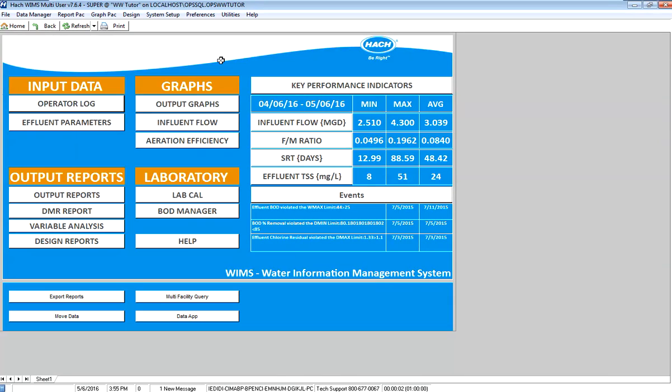In this video, I'll be covering entering data using monthly data entry forms. I've already logged into WIMS and I have my dashboard pulled up.